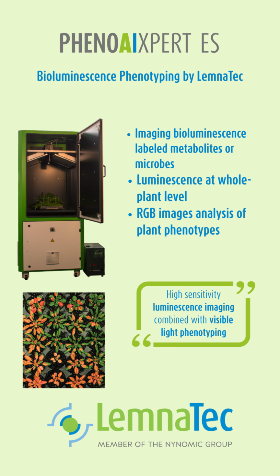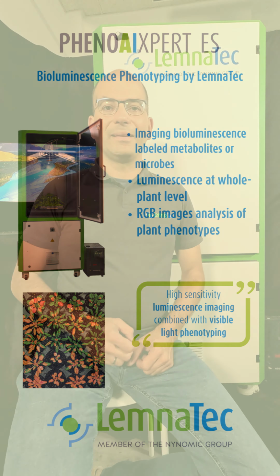This video gives an introduction into the bioluminescence phenotyping system PhenoAIxpert ES by LemnaTec. It shows how to operate it, and in the end there is also an example of an overlay of an RGB image and a bioluminescence image. Hello phenotypers! Let's have a look at the LemnaTec PhenoAIxpert ES.